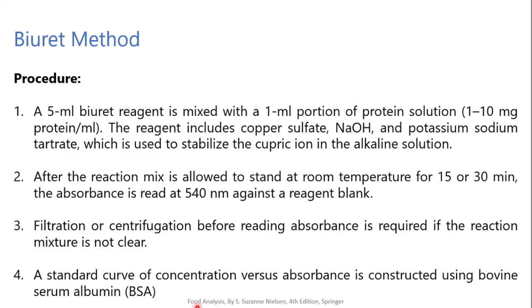Filtration or centrifugation before reading the absorbance is required if there is any precipitation or any small particles, then we have to filter the given solution.